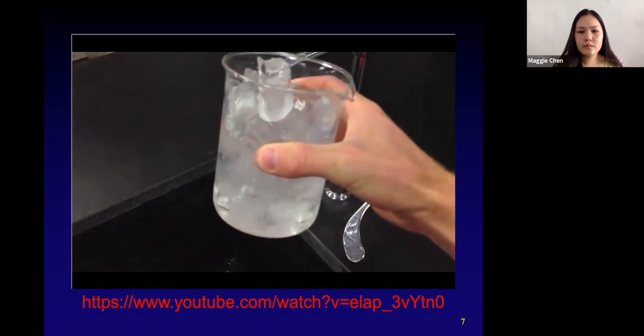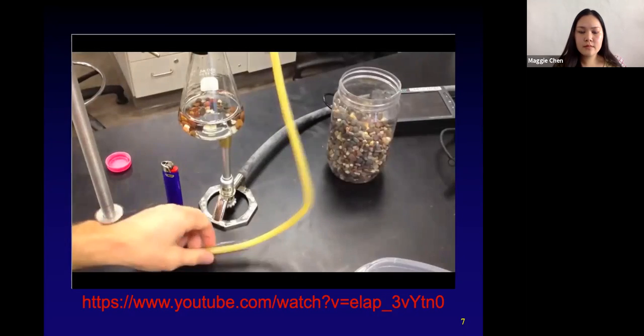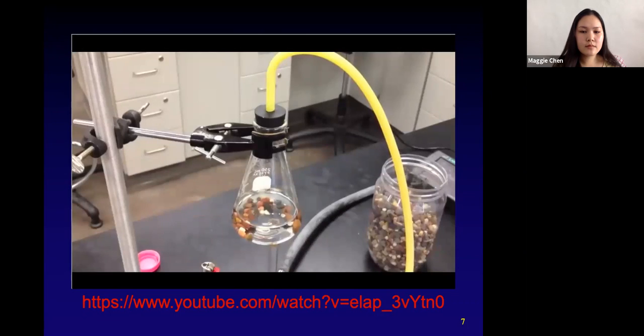Okay, so there's your ice water bath. Go ahead and put the test tube in the ice water bath. Before you start the experiment, you're going to want to measure how much salt is in that water. I made up the salt water to contain 8 grams per liter. Now let's use our conductivity probe to measure and see how much exactly is in there.